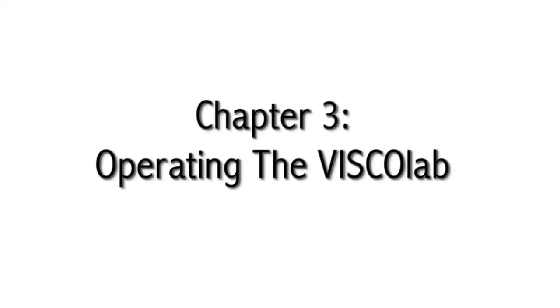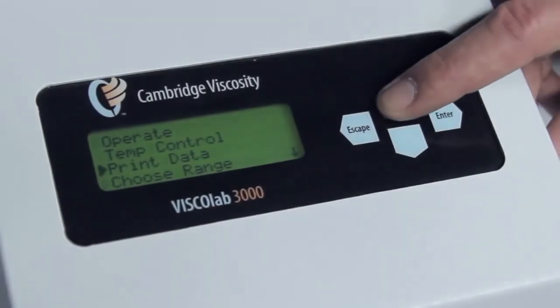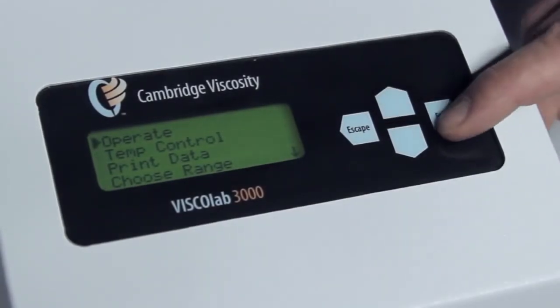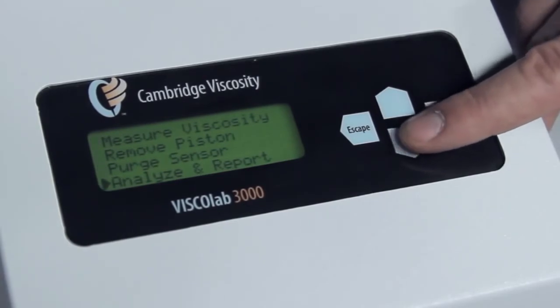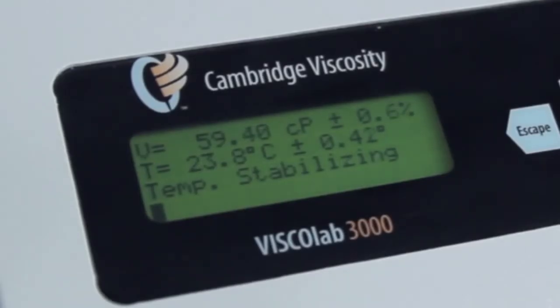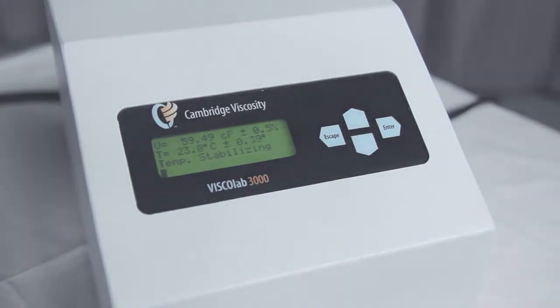Chapter 3: Operating the VSCOLAB. Push the up arrow three times and press enter on 'Operate.' Now press the down arrow three times to select 'Analyze and Report.' This should take a few minutes while the viscometer generates the report. The viscometer will go through the following six steps.